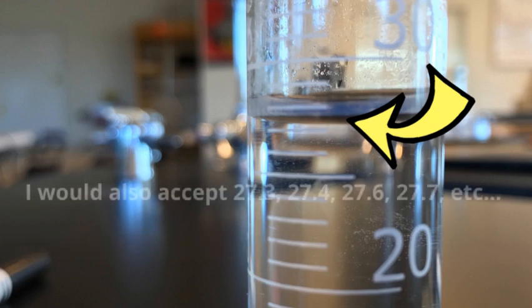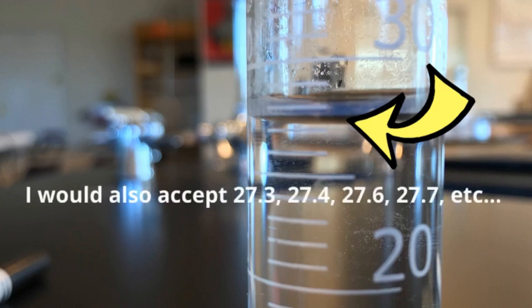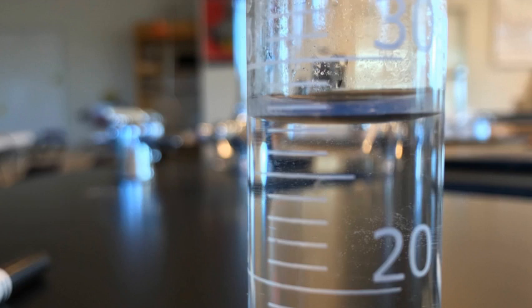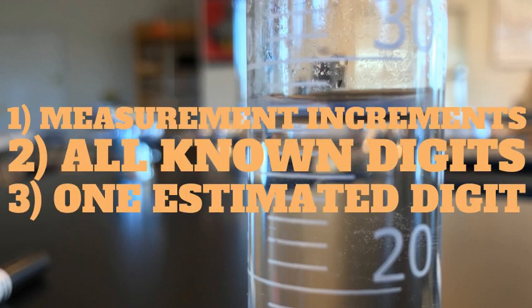Normally, if I'm not quite sure if it's right between the two numbers, I'm going to estimate a five because it looks to be pretty much right in the middle. But that is up to you. That's up to the scientist. Is it closer to 27? Or is it closer to 28? Or is it right in the middle? So again, every scientific measurement needs requires you to know the increments of your measuring device. It requires you to write down all the known digits. And finally, you end it with an estimated digit, and you are done.